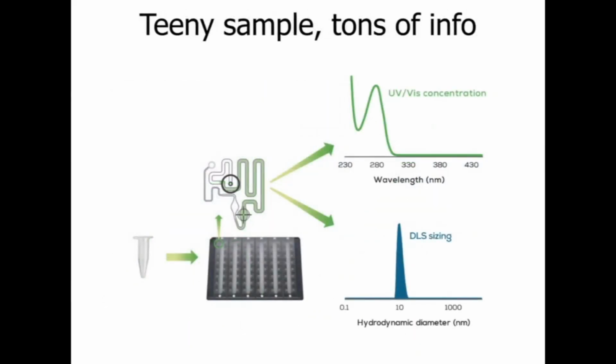In those 2 microcuvettes, we can then determine the UV-Vis spectrum to find out about the concentration of our analyte. In this example, we are of course looking at a protein, as signified by the high 280 nanometer absorption and the lower one at 260.